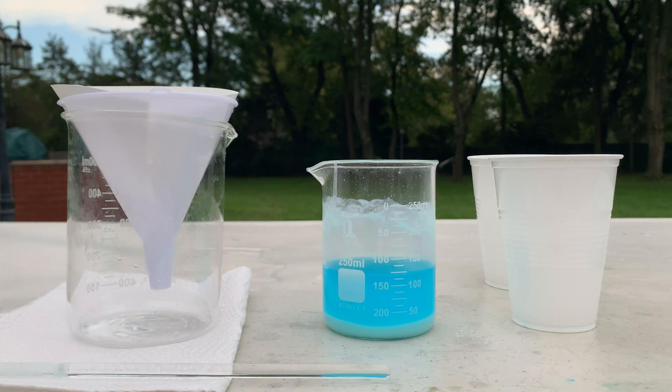I let the reaction sit for just a few extra minutes and now we can see that it's separated into two different layers. The top layer is a nice bright blue and the bottom layer is more of a light blue. The top liquid layer is probably some unreacted copper sulfate, some sodium sulfate produced from the reaction, and some water. At the bottom we have our copper carbonate and maybe some unreacted sodium bicarbonate.